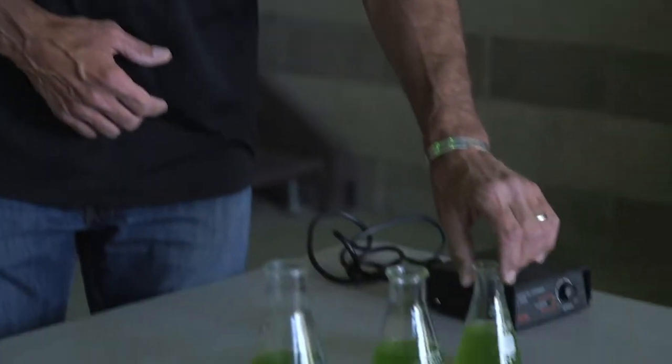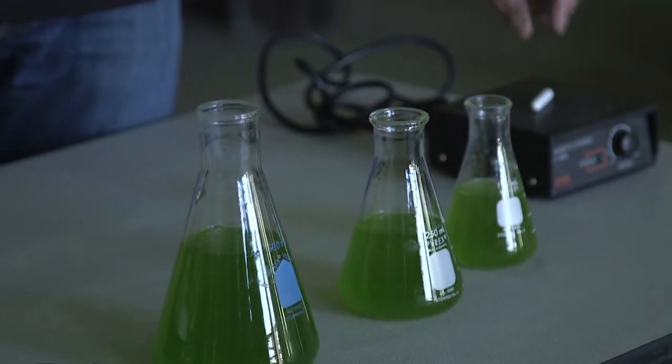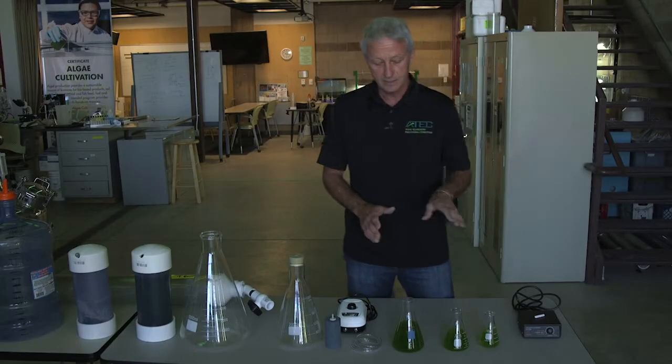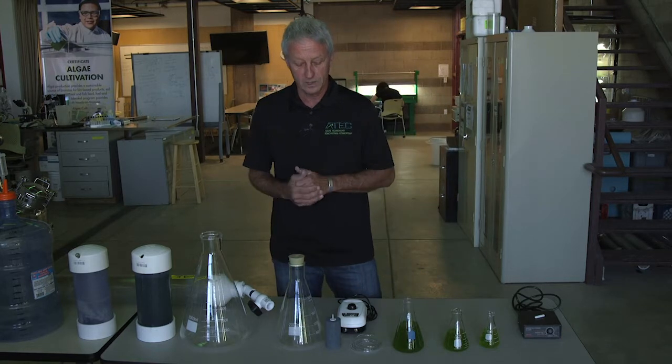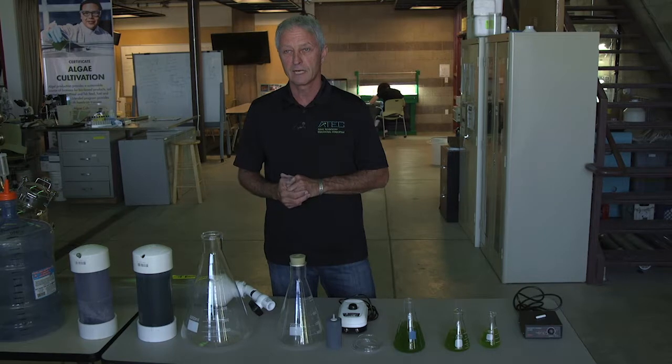Typically in a lab, as you're scaling up, you go from small scale to slightly larger systems and use a magnetic stirrer, keeping it in your laboratory. When you get to the point where you actually have to scale up, things start to change after one liter. You have an option — you can move into glass, which is a typical laboratory thing to do.